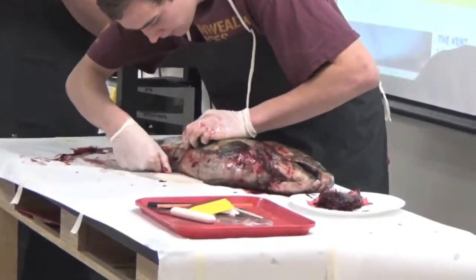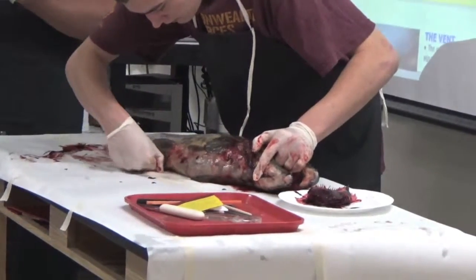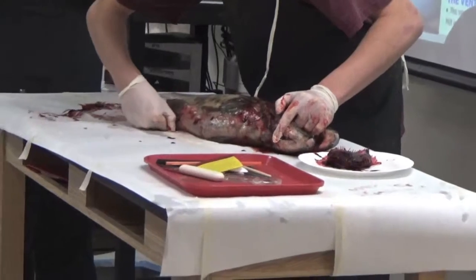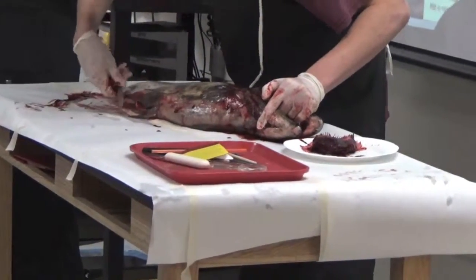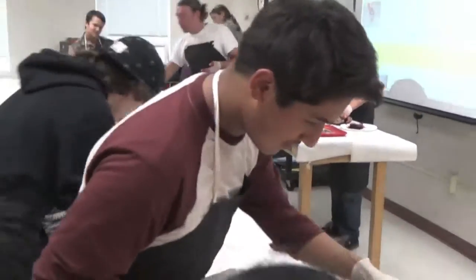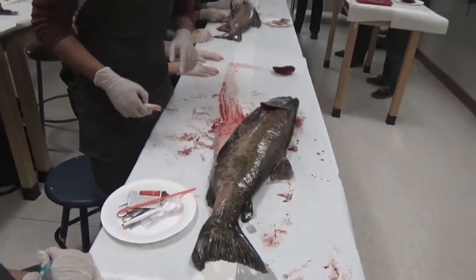Very close to the anus is where, when we were at the hatchery milking and pulling the eggs out, the reproductive organs are also near the anus. So in that ventral part of the fish, right down almost by the ventral fin.